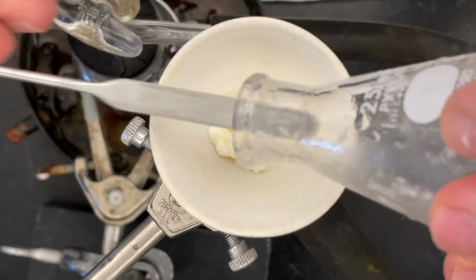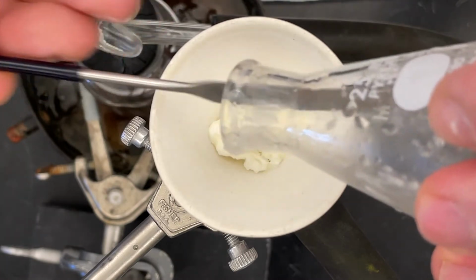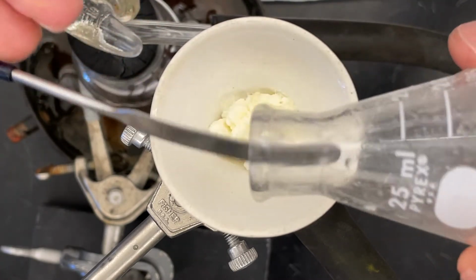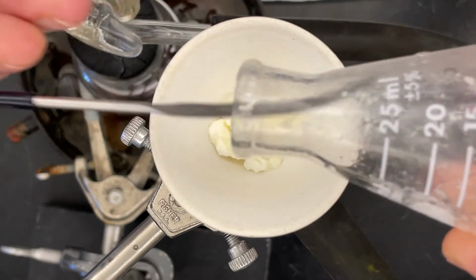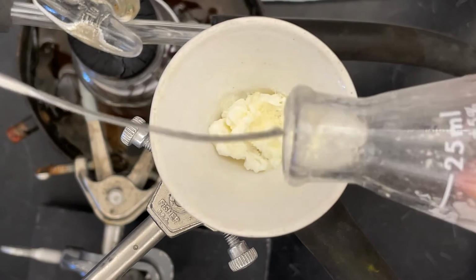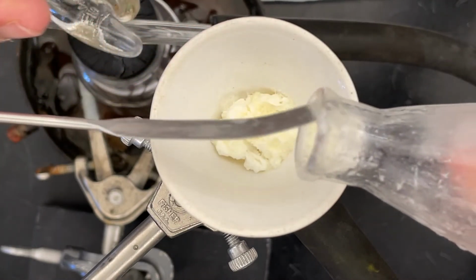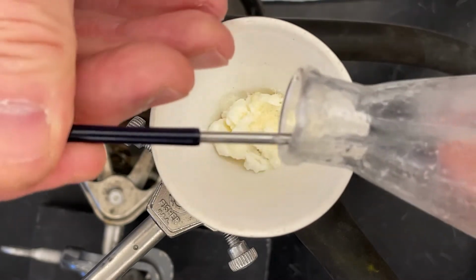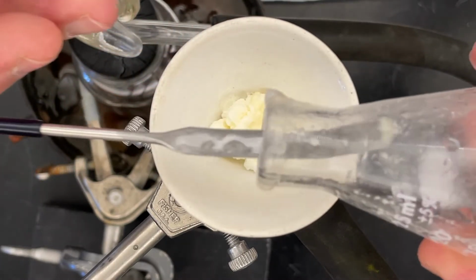And again, we're doing a multi-step. Our next reaction is dependent upon how much we get on this reaction. And so we're trying to be careful to keep our yields high. Be careful about how we're getting all of our product out of this. Just going for all the big stuff we can. There is diminishing returns. At some point, we got to move on.